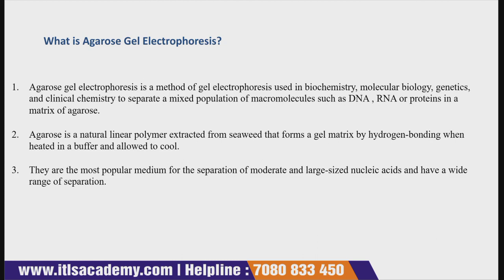Sometimes in interviews or in MCQs they ask you what agarose is, so you have to tell that agarose is a natural linear polymer that is basically extracted from seaweed, and that forms a gel matrix by hydrogen bonding when it is heated in a buffer and further allowed to cool.